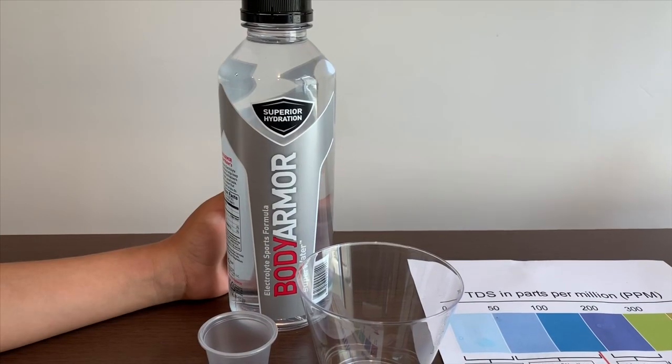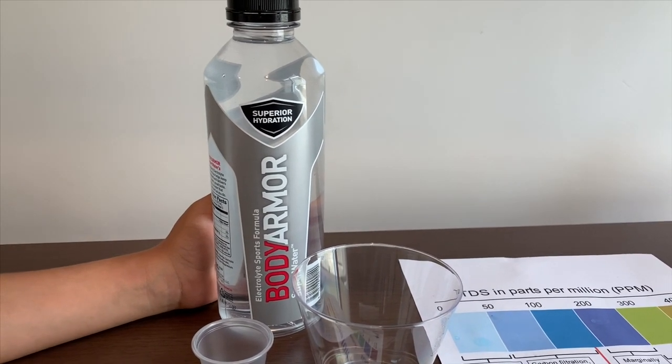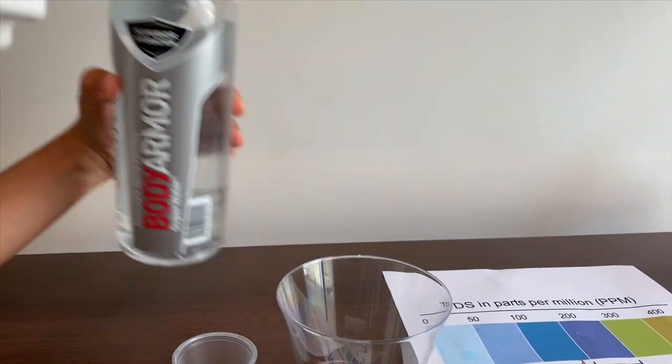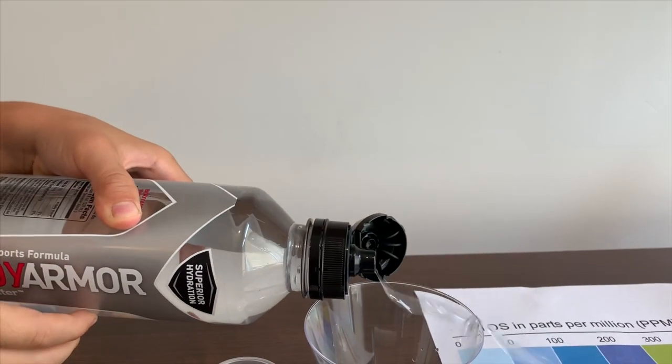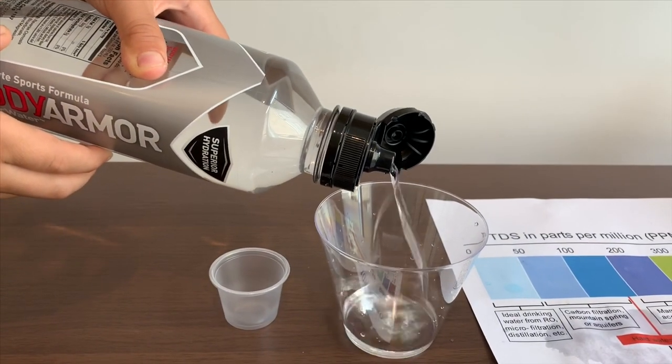This is Body Armor with electrolytes — it's a sport water. First we're going to test the pH, and then we're going to test the TDS.